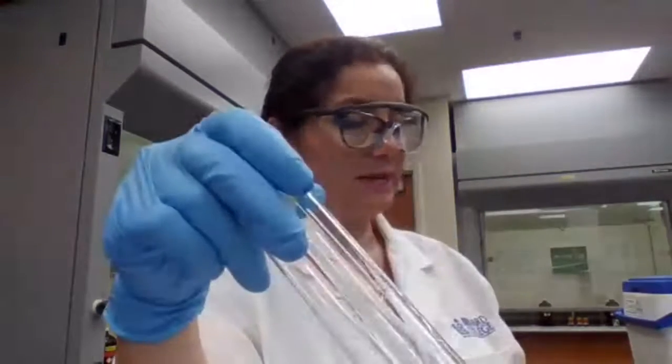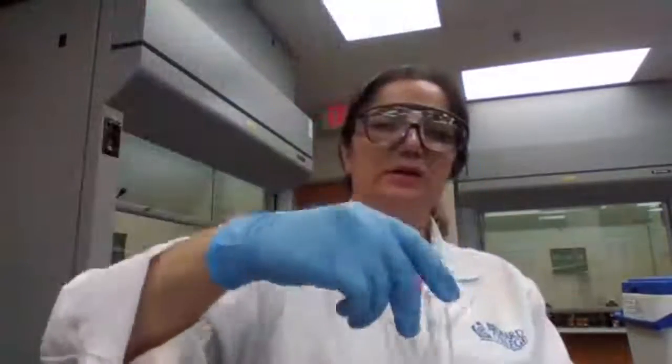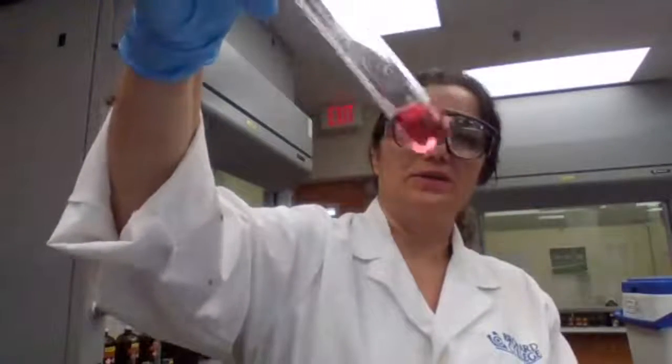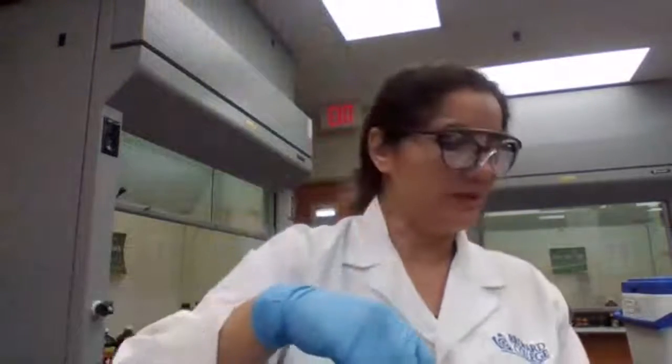Then we are going to add HCl. And I hope that you understand, if I'm adding HCl, I'm basically adding Cl minus to the reaction mixture.